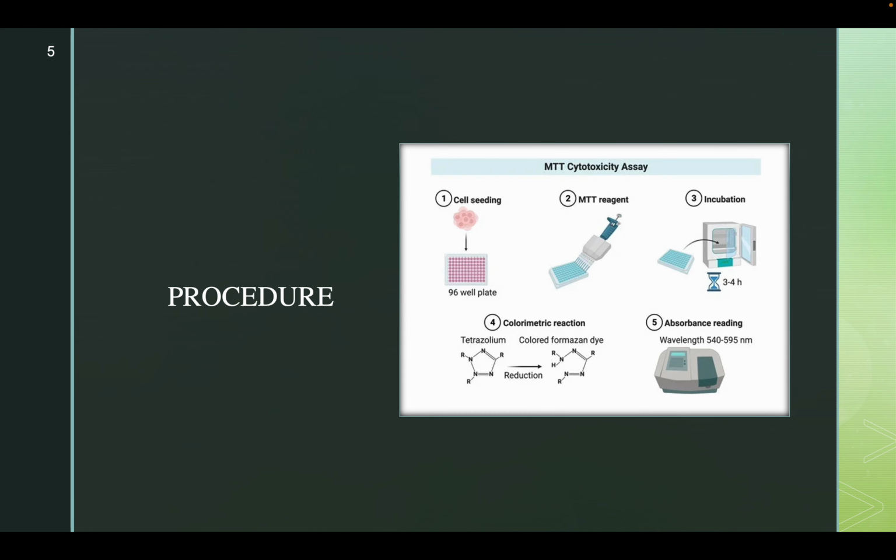For example, if you want to test a drug, you want to make sure the drug will affect and lead to cell death or cell life, so you will compare the control that you don't treat with the drug and the sample that you treat with that drug, and the cells will increase, or the cells will live, or the cells will die and decrease. This is why we must make sure that the number of cells we add is equal.